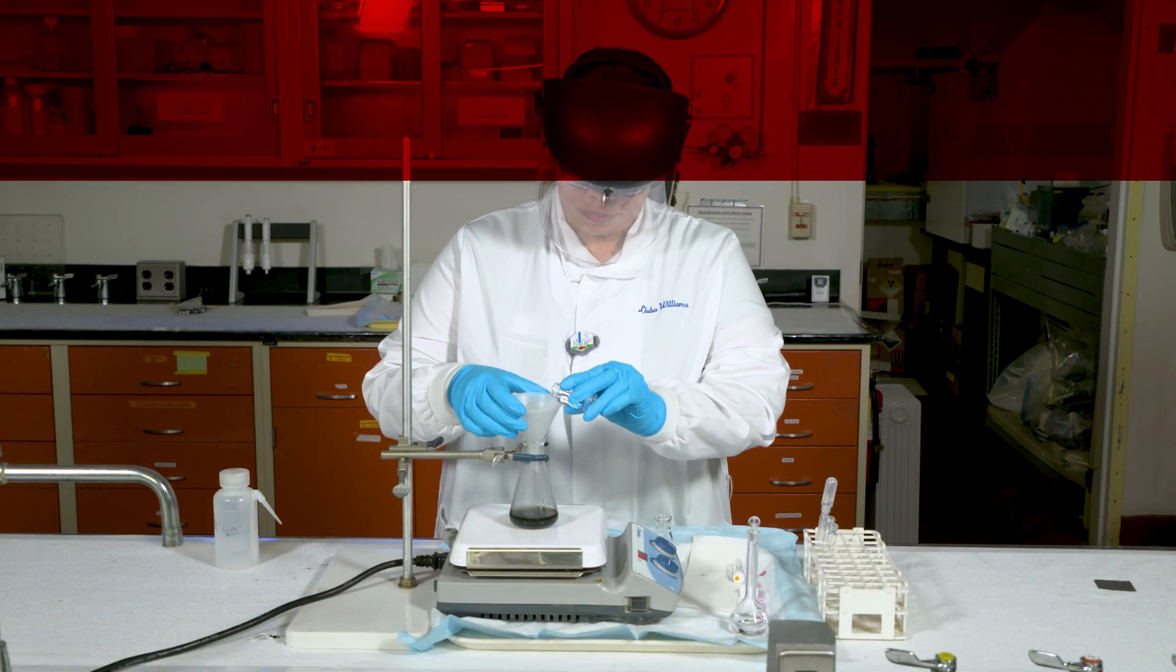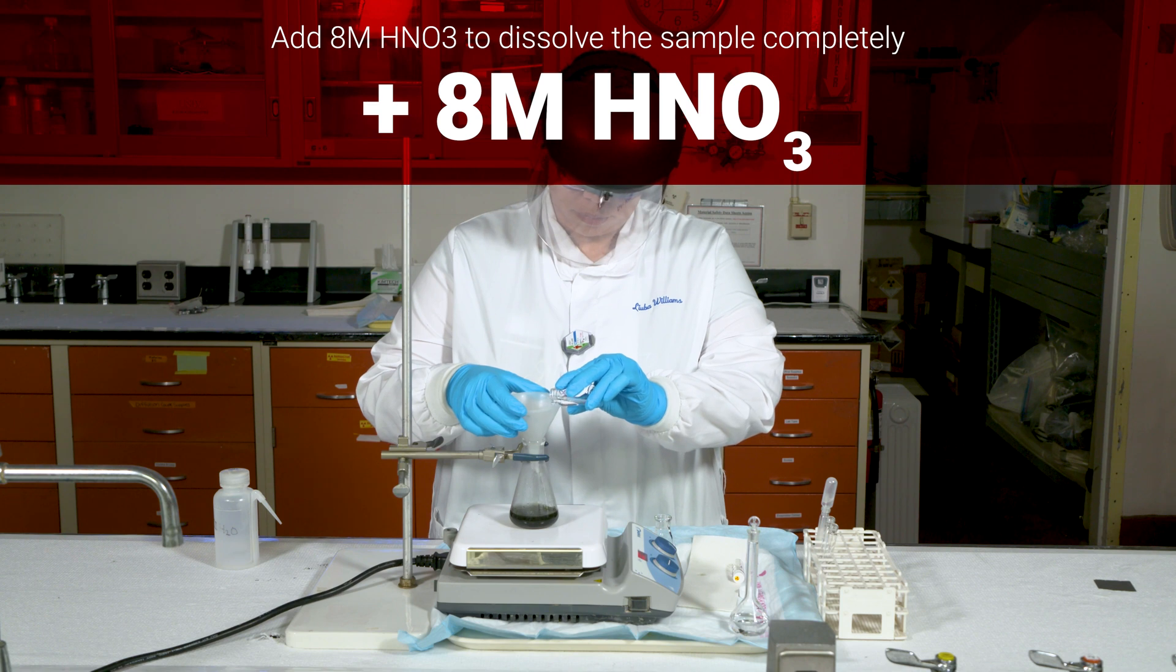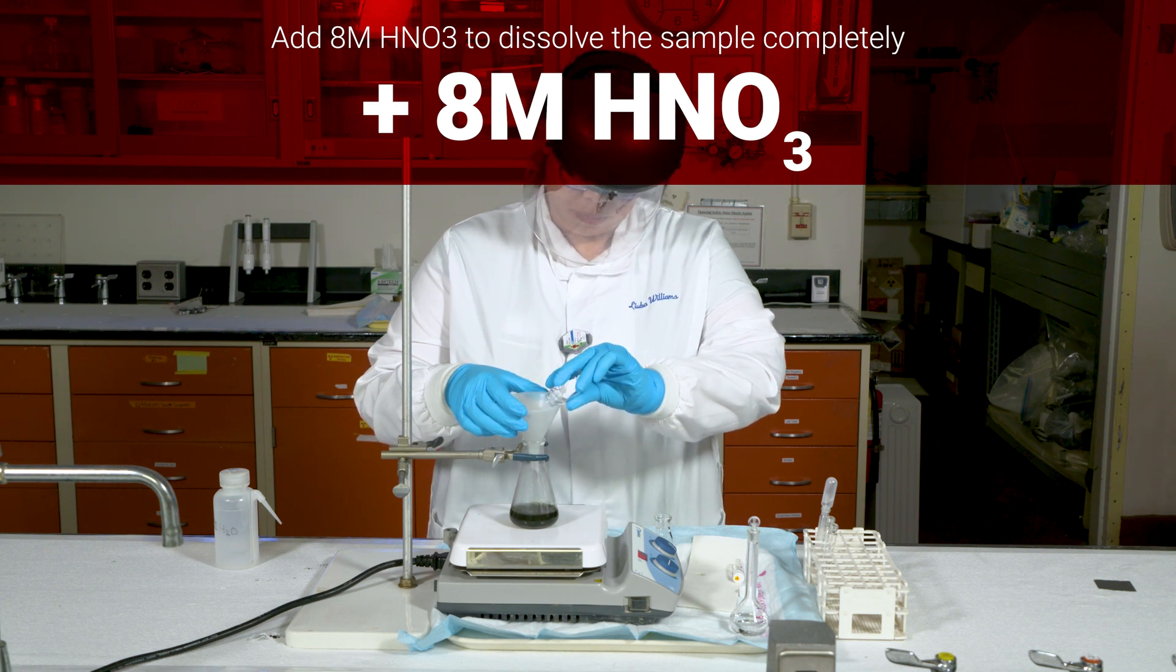To completely dissolve the sample, 8 molar nitric acid was added to the flask and the solution was heated at about 90 degrees Celsius.